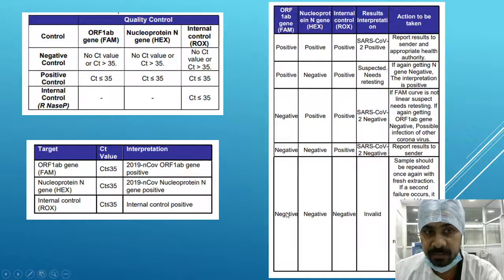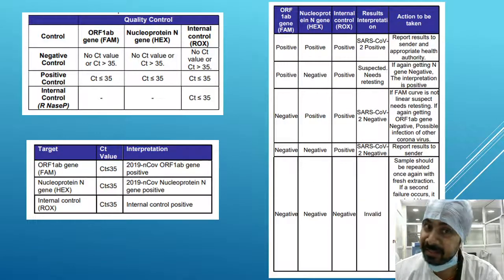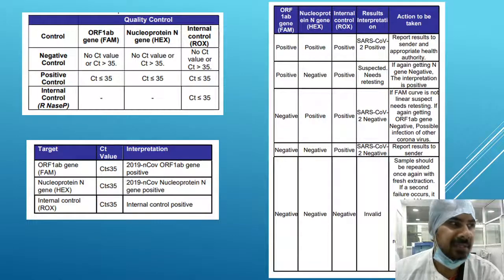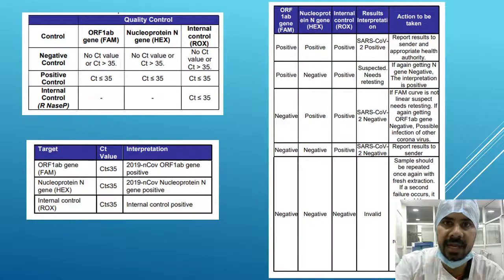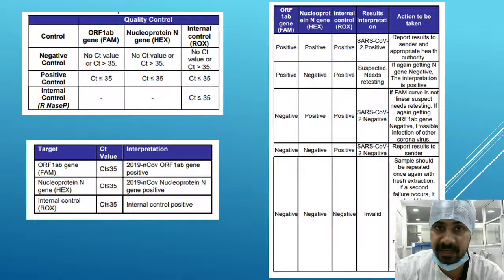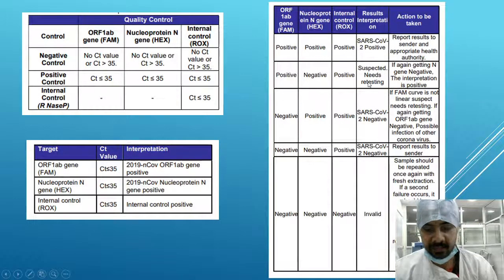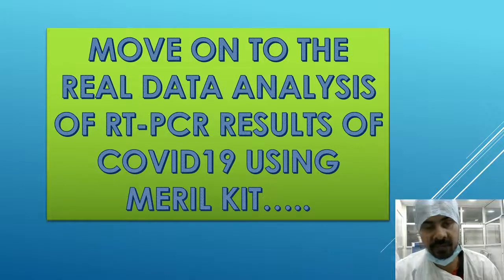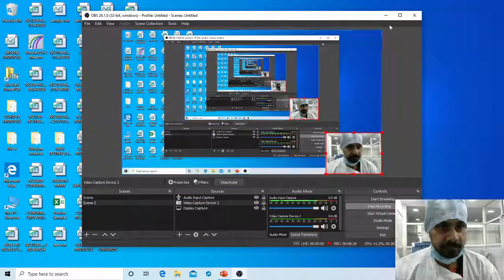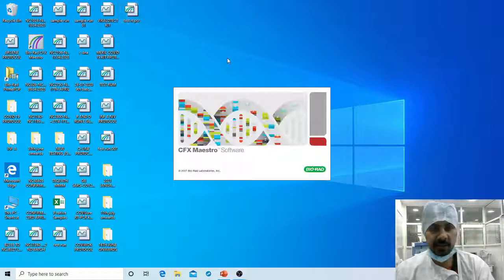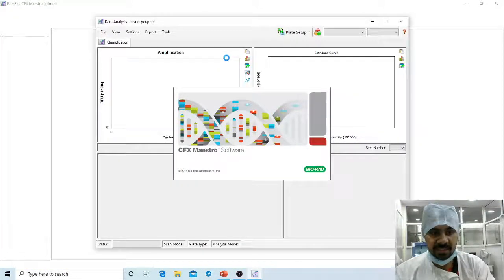If ORF1ab is negative, N gene is negative, and ROX is also negative, that is an invalid test. ROX cannot be negative — if it is, something is wrong with the test. It may be that someone sent plain VTM to the lab without extracting the sample from the patient. That result is invalid. Next I will show you through the CFX software how the results are declared.